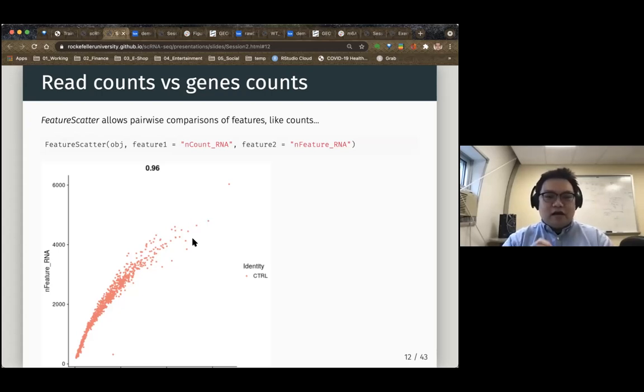That means two or more cells clumped in a single droplet, so this droplet has more genes and more reads detected than the rest of the distribution. I will introduce how to evaluate and remove doublets in section 3.